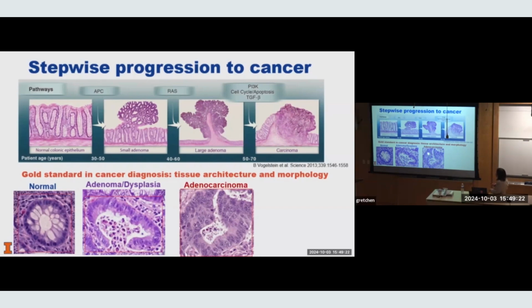If you look at these changes, there are morphological changes of either the architecture of the tissue or the nuclear morphology. We spent many years understanding which nuclear morphologies can be physically detected using optical techniques. This is not a complete list, but it shows some of the characteristics of the nucleus, like size, shape, and chromatin texture. One of the amazing things I appreciate more as I learn more is that these days we talk about mutations and lots of molecular changes, but this kind of physical change is actually independent. It's almost ubiquitous across different tumor types. From an engineering standpoint, that's good news.